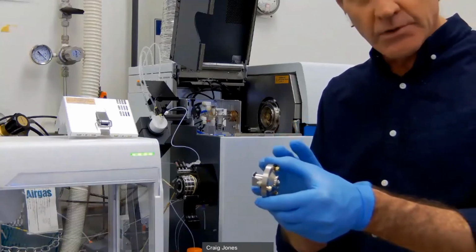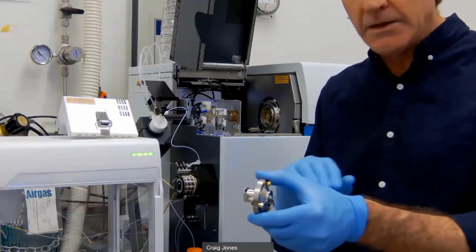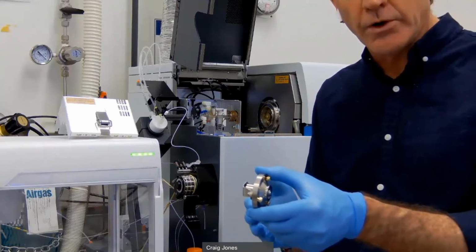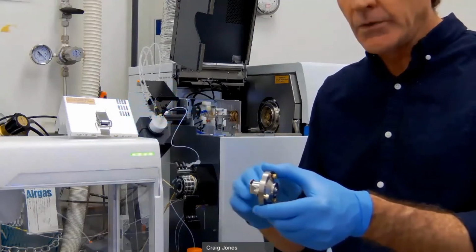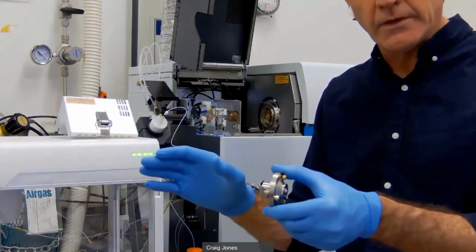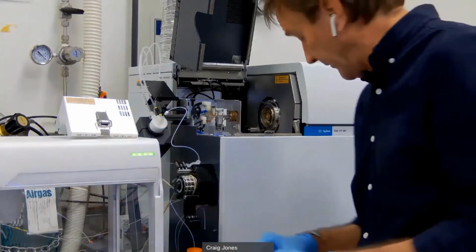As you can imagine, the lighter masses get pushed to the outside of that collimated ion beam, and if they have to go around an aggressive corner, they might actually just fly off of the ion beam. So this keeps them intact so that they enter the cell as well. We're talking about elements like lithium, beryllium, boron, all those light mass elements.